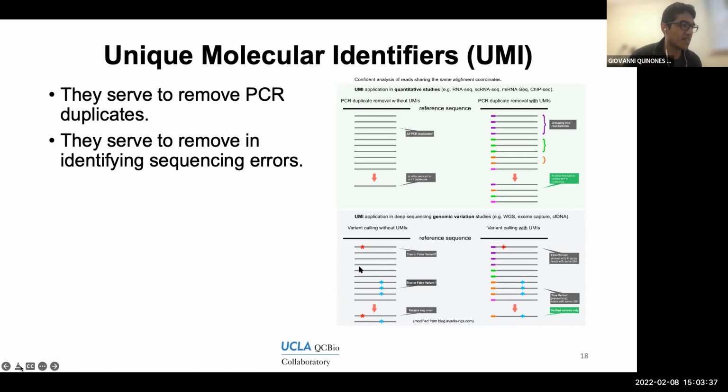The point is that at this position we have one variant, meaning the base doesn't match the reference. And on these other reads, we have other mismatches over here. So we'll identify the presence of 2 variants: some reads contain variant number 1 and another read contains variant number 2. So there must be 2 variants in this sample.